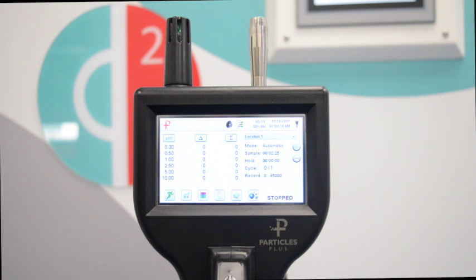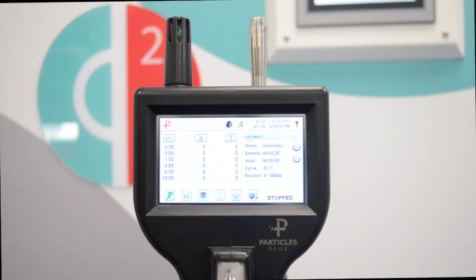Avoid positioning it directly under the fan filter unit airflow as you would get unrealistic clean counts. The report will record the average of all locations but to pass, all locations need to be under the upper limit for the class.